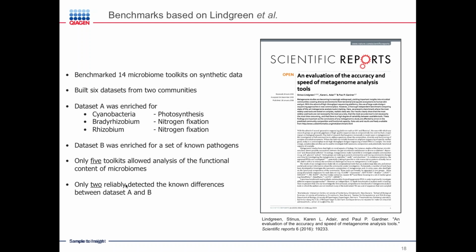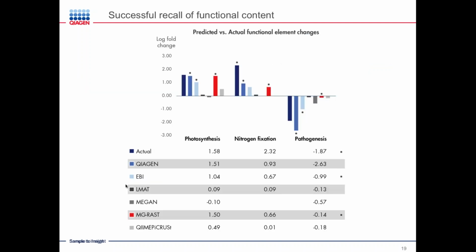So we thought this was a very nice benchmarking dataset that we would benchmark our solution on. So we went forth and did that, and this is the results from running the pipeline that I showed you just 2 minutes ago.